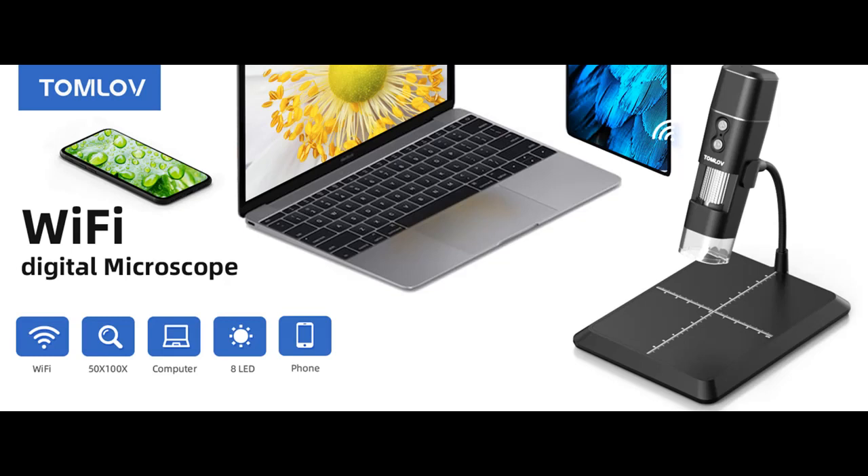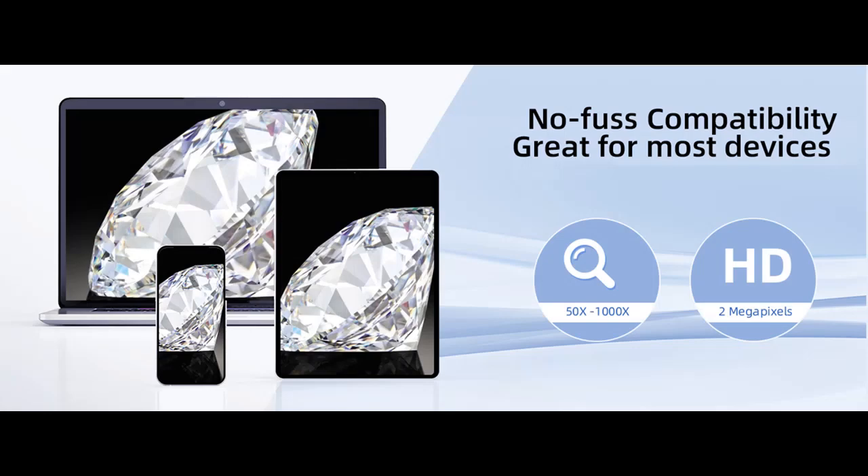More than a microscope, it has an amazing ability to zoom in and out to focus precisely on what you are looking at. This video microscope allows you to see enlarged videos in real time, snap an image, and record videos with the built-in digital imaging system.